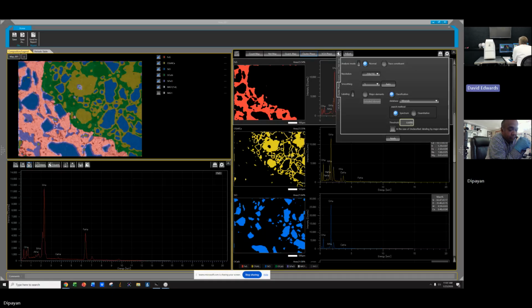Yeah, but the problem is when you're going to search, you can't search two databases. Oh, it has to be one database to search everything in that image. Correct. Which means paste has to be there. Okay. Yep. Okay. So let me think about it, how I can handle that.